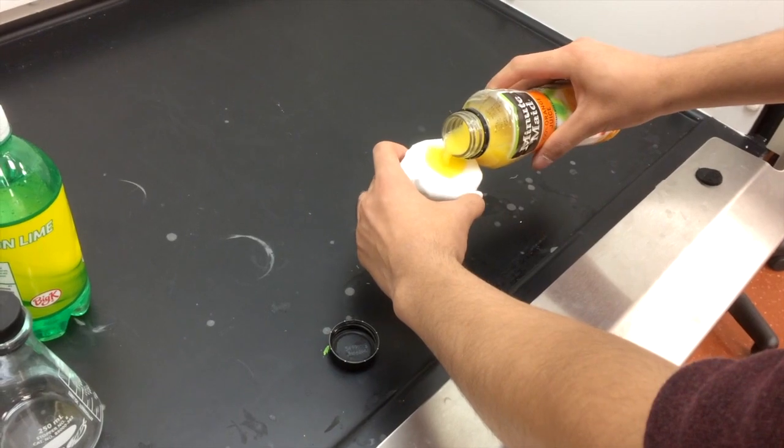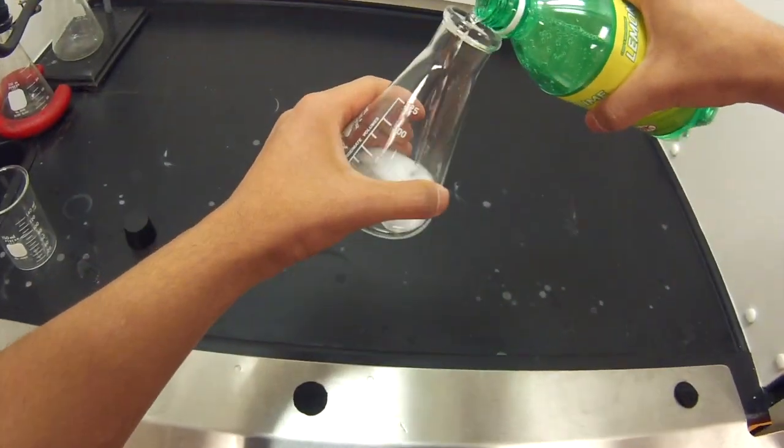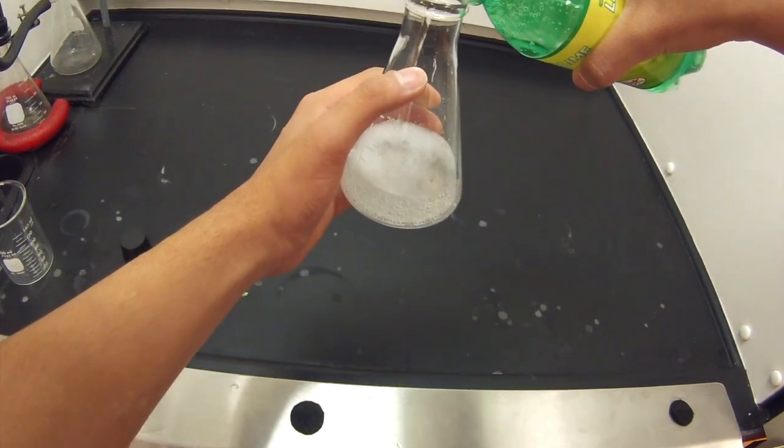Use a piece of cheesecloth to strain any solids from your sample, or use an Erlenmeyer flask and a stopper to remove any carbonation from your sample. Set these aside.